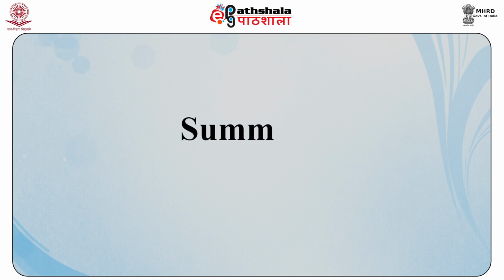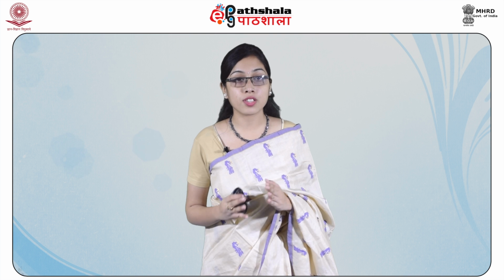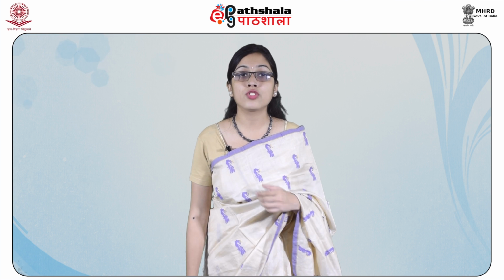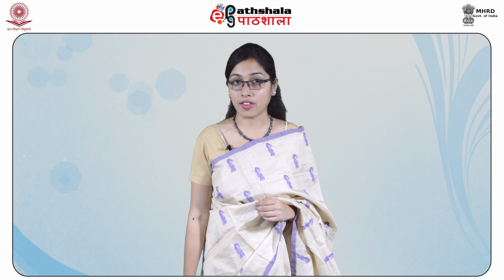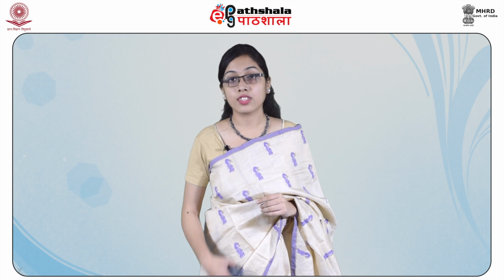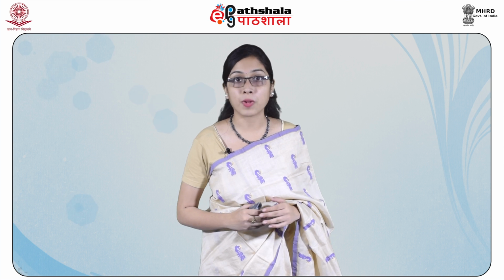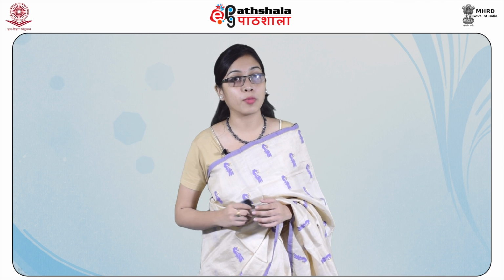Now students, let us summarize all that we have studied in this module. Chromatography is a technique in which a chemical mixture is separated into individual components due to differential distribution of the solutes between a stationary phase and the mobile phase. The mobile phase can be either a liquid or gas. The stationary phase can be solid or liquid. Chromatography can be broadly divided into two types. One is planar chromatography and the other one is column chromatography.